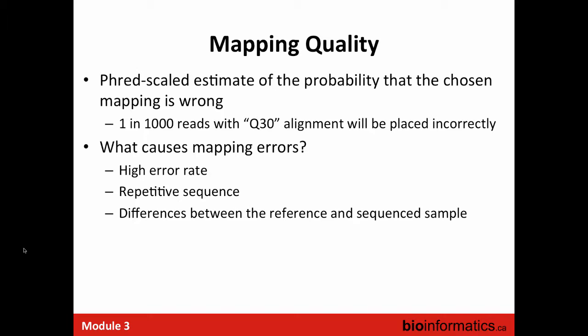Certainly, the mapper is the program, not the human behind the program. Yes, the mapper is the program. Yeah, like BWA is the mapper in this case.